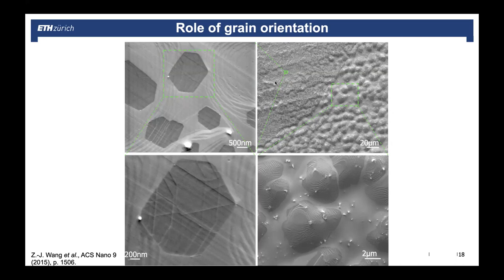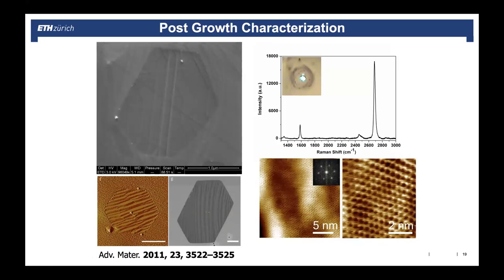And okay, this is just a slide to show that we really have graphene. This is our graphene, literature graphene. We did Raman and we did STM, which is beautiful graphene. But let's come down to these reconstructions.